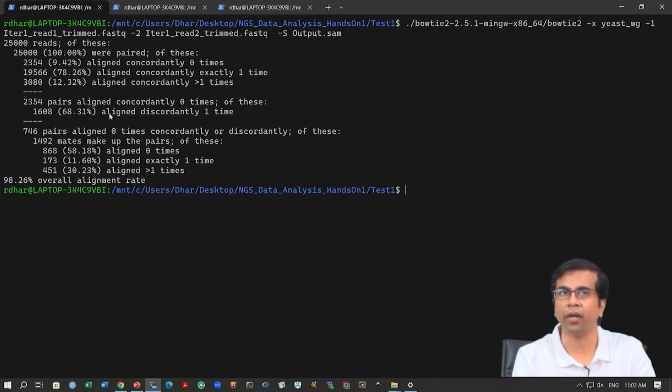Out of those 2,354 that did not align concordantly, the program then tried discordant mapping, and it found discordant mapping for 1,608 reads. The rest of them, the 746, were aligned independently. That is what the --no-mixed option will stop if you give it. So, let us try those first two options, --no-mixed and then --no-discordant.